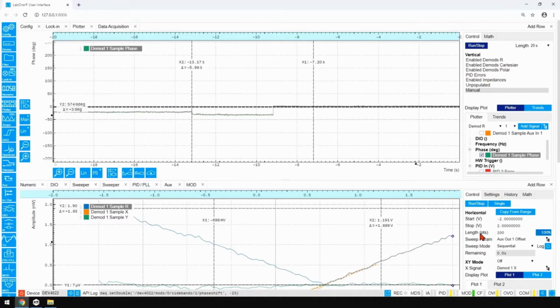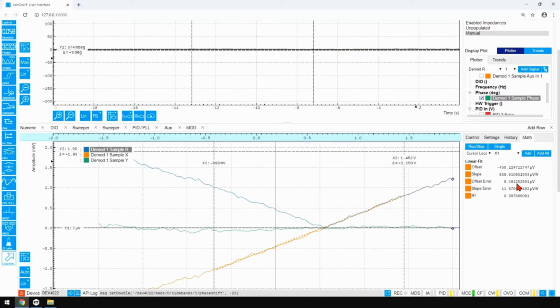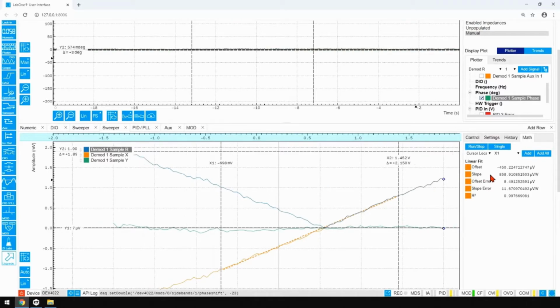So this is exactly what we got. We had a nice stable phase where the Y component is flat, and then all the contribution is again on this X component. So we are a little bit back to square one, like we had before, except that we have this phase sensitivity. Overall, you see that the gain is weaker, and this is not so surprising because we are sensitive to the force gradient and not to the force only. So we do not have this background contribution from the cantilever anymore. We are more sensitive to the tip contribution, but the overall signal is weaker.